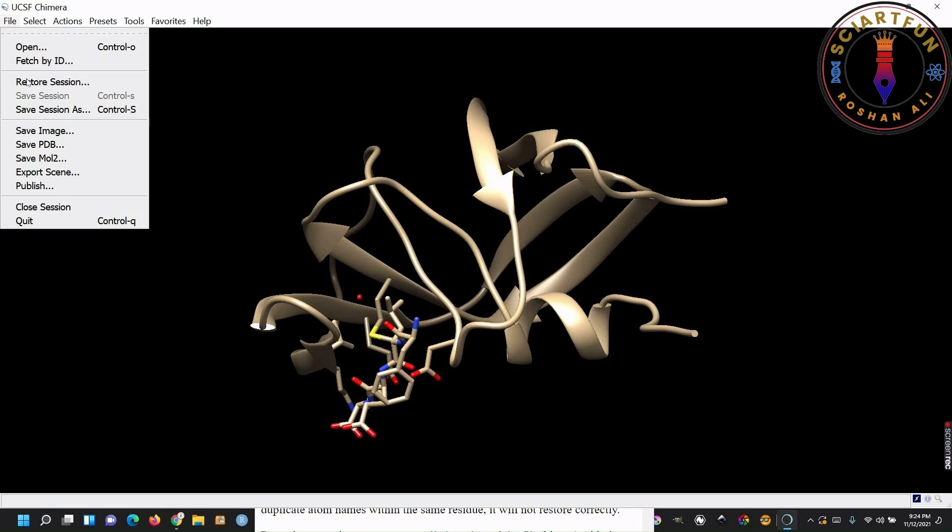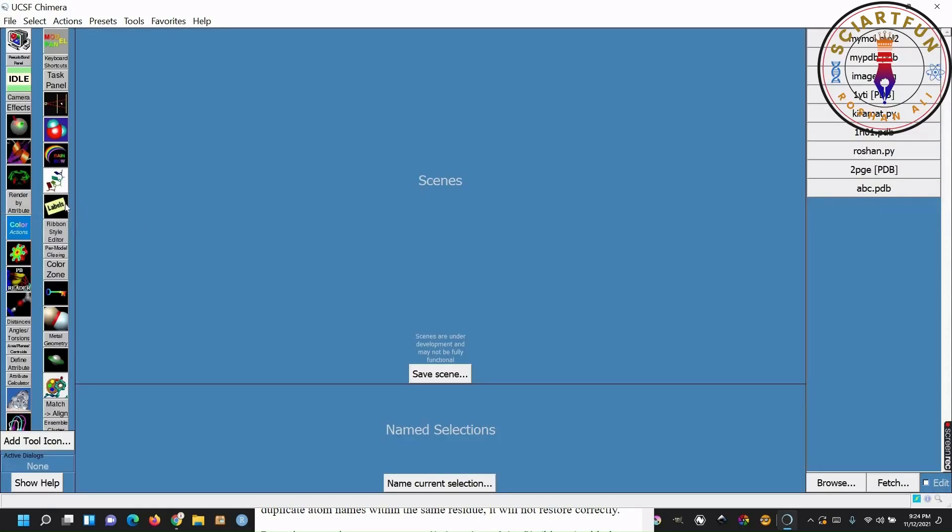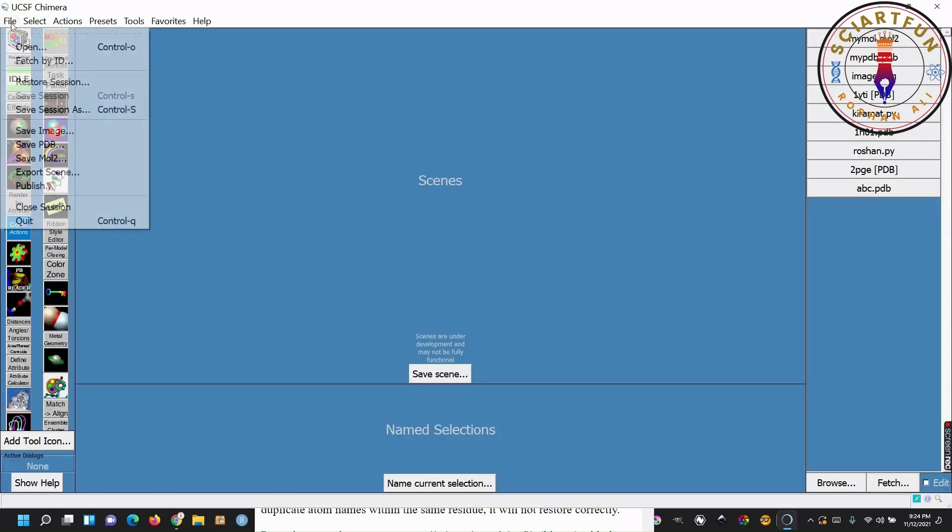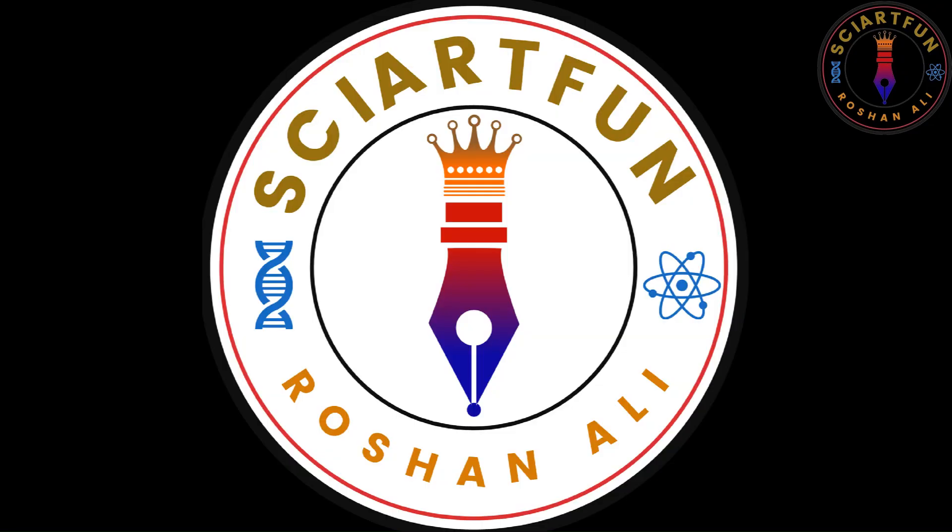Now let's close Chimera. Just go to file, click on quit. Your Chimera is closed now. So this was all about the file menu. In my next lesson, we will inshallah learn about the select menu.